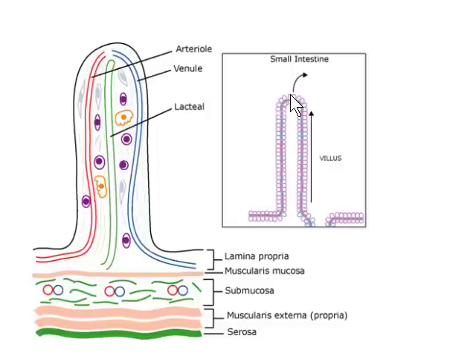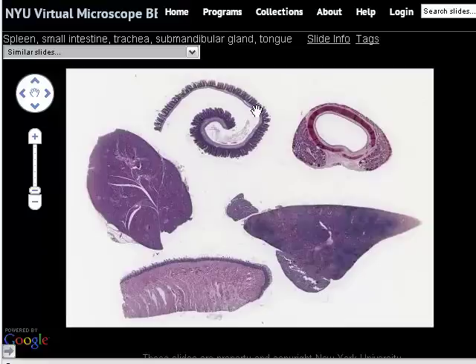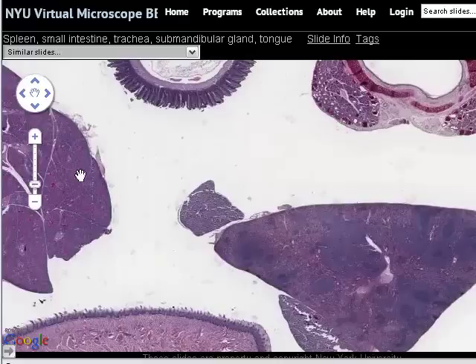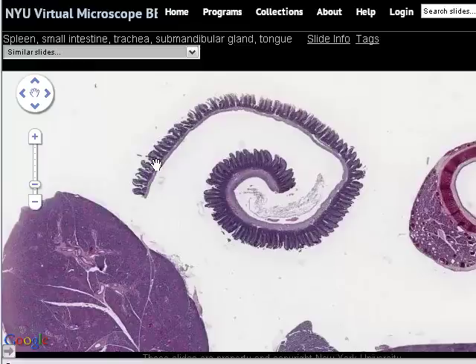Here we are back at our NYU VM multi-tissue slide, which we began by looking at the trachea. This section here is the section of small intestine, and even at very low magnification it should be apparent that there are these finger-like extensions or villi jutting out from the remainder of the wall of the intestine.